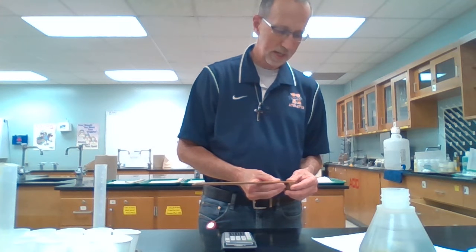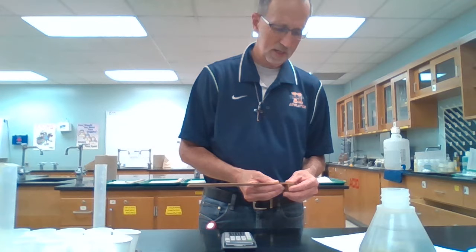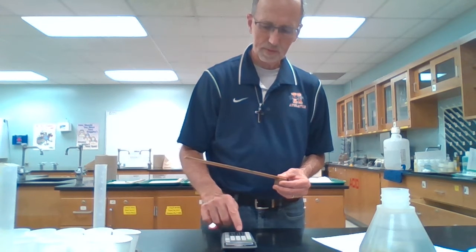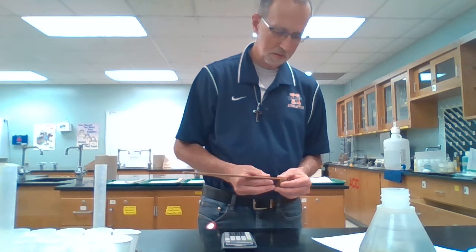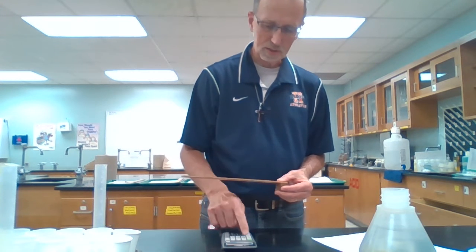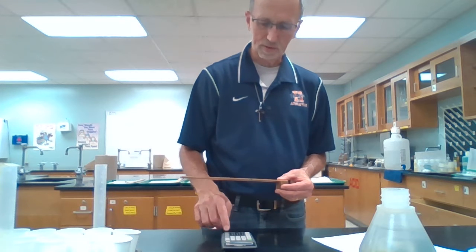Looks like we got about 2 point, it's right in between 0.4 and 0.5. So I'm going to say somewhere around 2.45, it looks like. I'm going to multiply that out. Actually, it looks closer to 2.50 now that I look at it again. Had to slide that over to hit the 0 line.